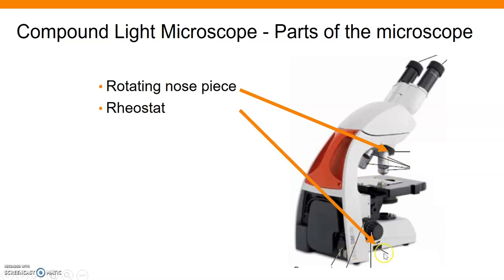Down at the bottom here, if you're looking in right here, your left hand would be sitting right by this dial. This dial is called the rheostat. This is going to control how much light is actually coming up through the microscope. The light on this microscope is right here. The light would come up and pass through all of these mechanics so it can pass through the actual slide sitting here. You can actually adjust how bright this light is, and that's with this rheostat. In general, you want to keep it somewhere in the middle. Please don't turn it all the way up or all the way down, especially all the way up because you'll blind the next person that uses the microscope. Be gentle on our eyes.